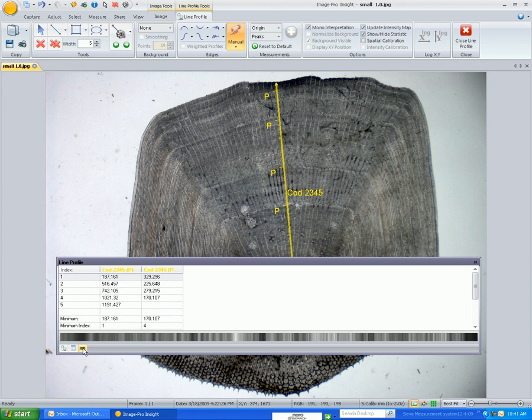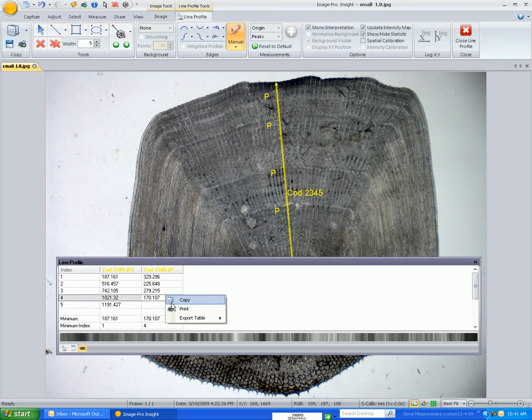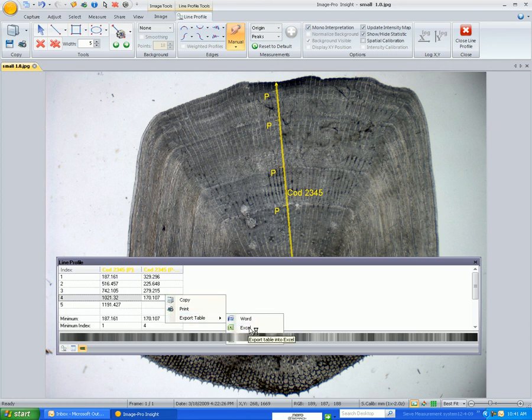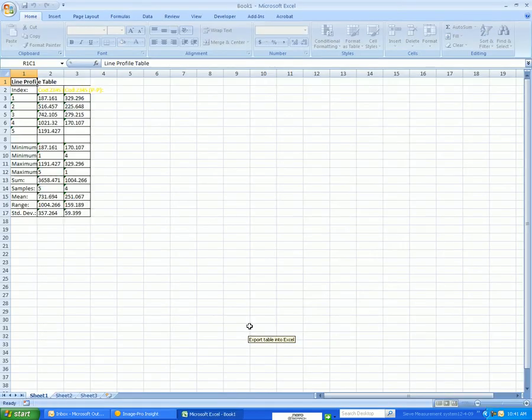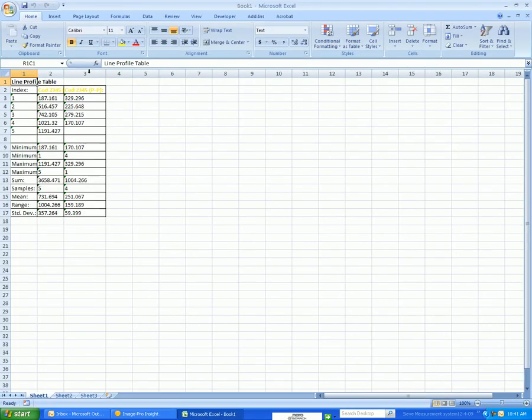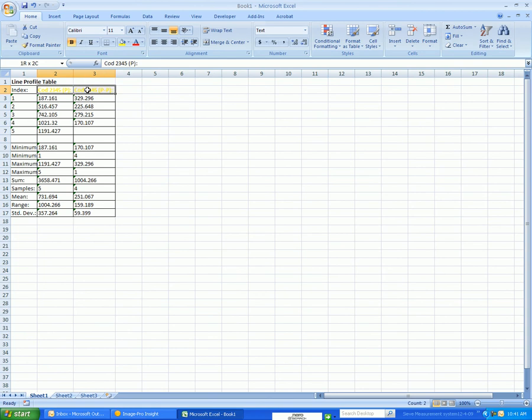Now I have this data and I want to export it to Excel. If I click on this button it should export to Excel. The other way I could do this is to right-click and go to Excel — it's now going to put the data there.